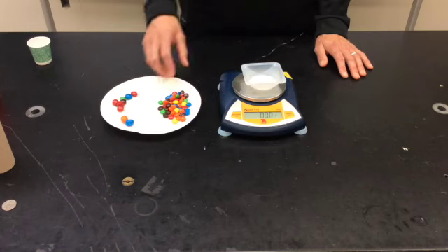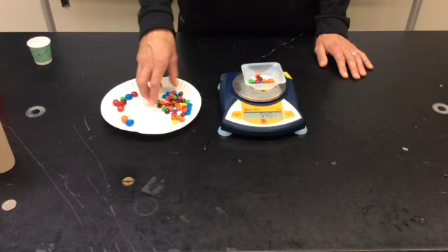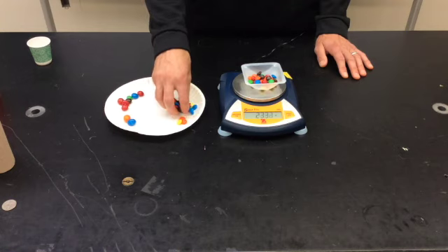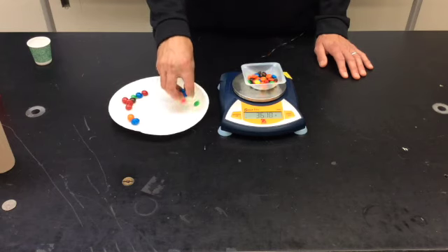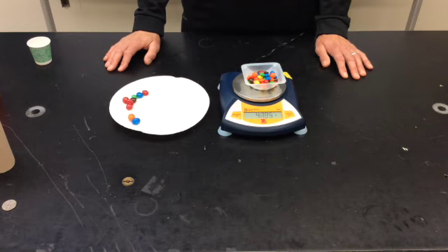We're going to zero our balance, and then we're going to gather all of our plain M&Ms and take their mass. The mass of our plain M&Ms is 42.05 grams.